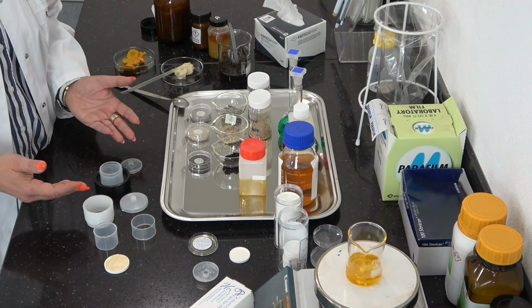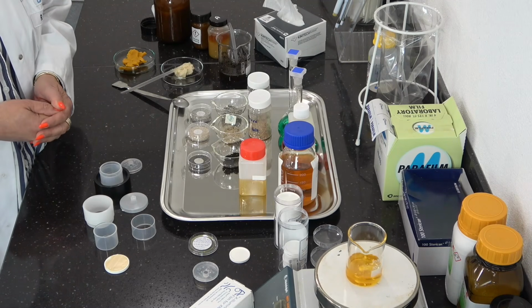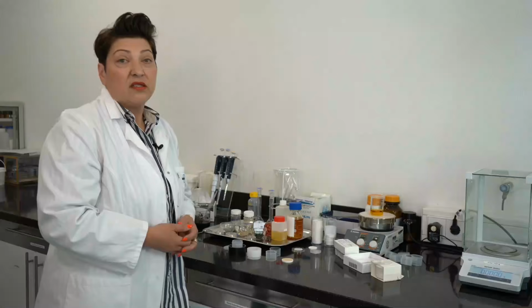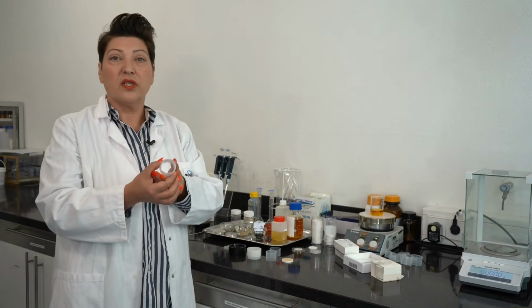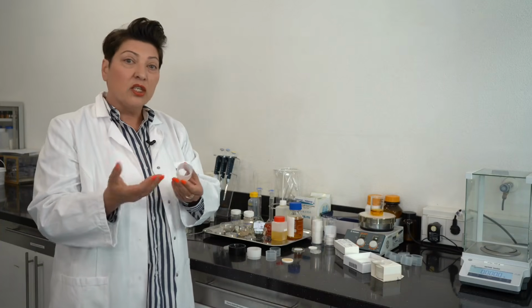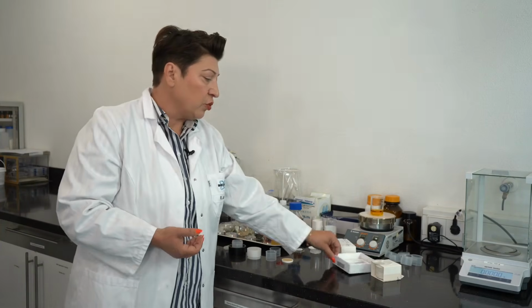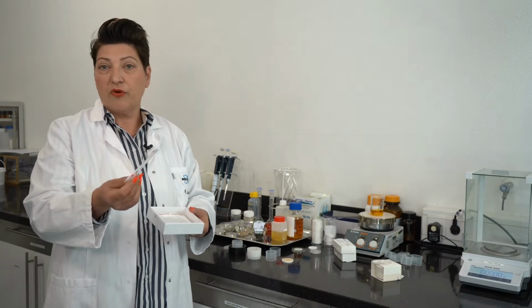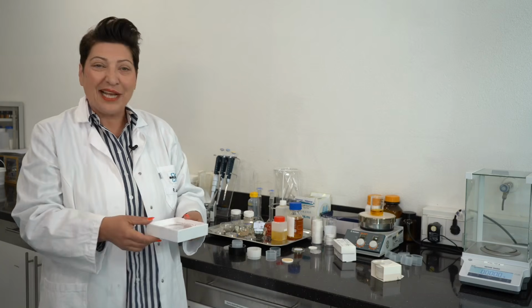What is important? There are a few tips and tricks. I would also give you some more information on this. So if we work with the foils for the liquid cups, as you can see here, the liquid cup is stringed with a foil. Different foils are available. You can have these foils which are already put on a tray. So this is a very easy way to prepare the samples. This is the one I really like the most.